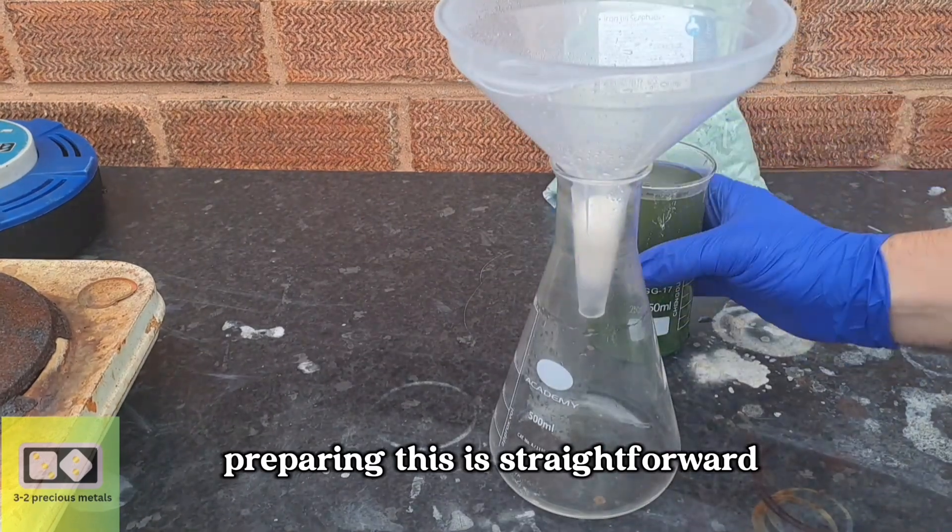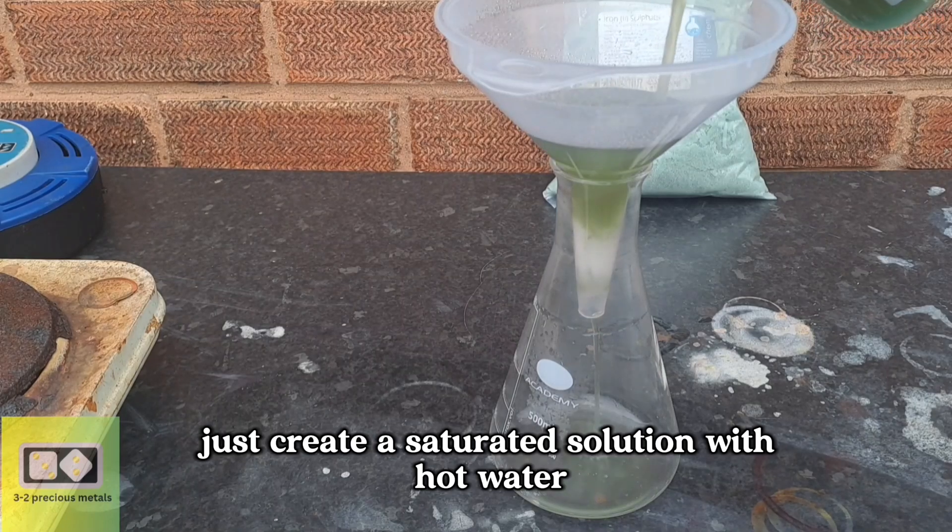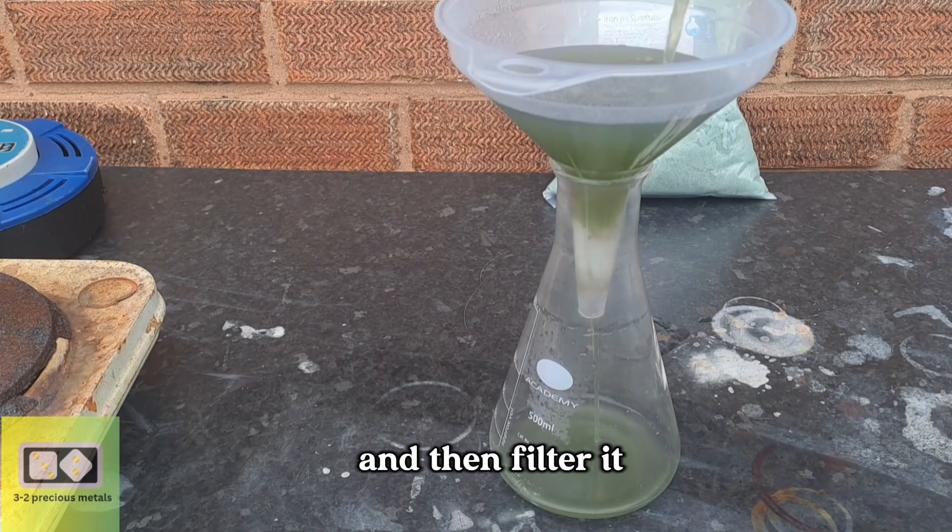Preparing this is straightforward. Just create a saturated solution with hot water, and then filter it.